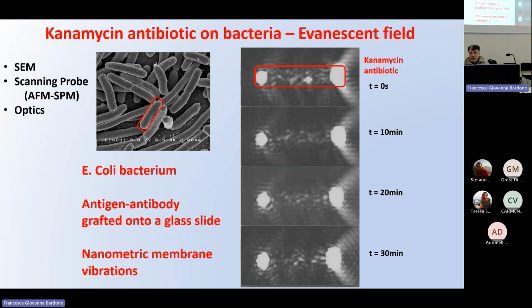The same bacterium was extracted, grafted and placed on a scanning probe microscope. It's not an electron microscope. It does not use electrons to see the object.